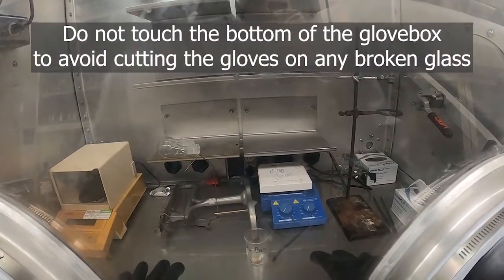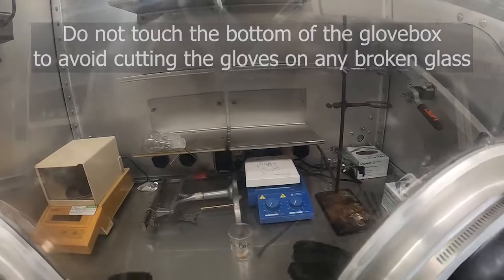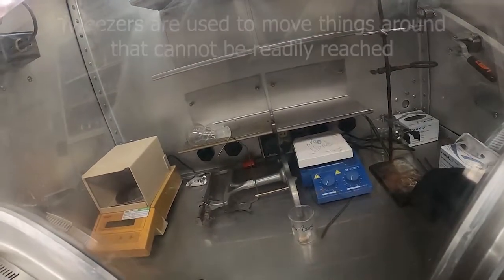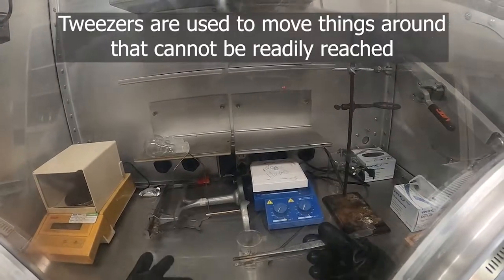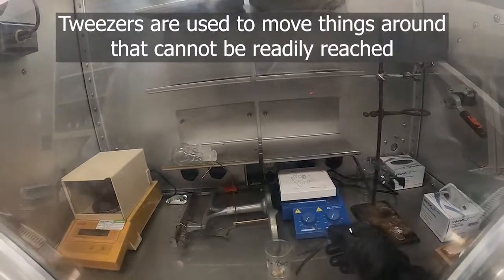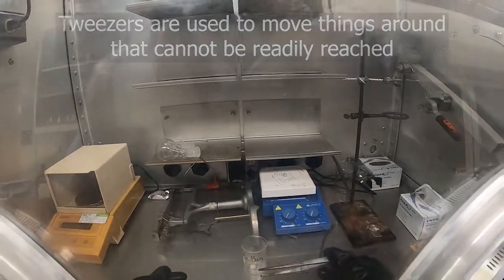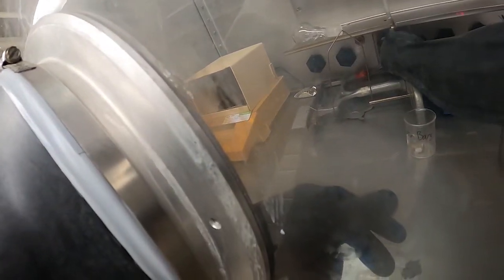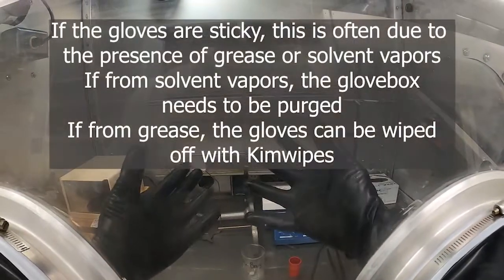It's important not to touch the bottom of the box so you don't get the gloves dirty or touch anything sharp that might cut the gloves and compromise the atmosphere in the glovebox. If you can't reach the back or need to pick up small things that are off the bottom or hard to reach, tweezers are often used. For instance, you can pick up a stir bar with tweezers quite easily, or if you need to get a septum that's way in the back, you can use the tweezers to do so.